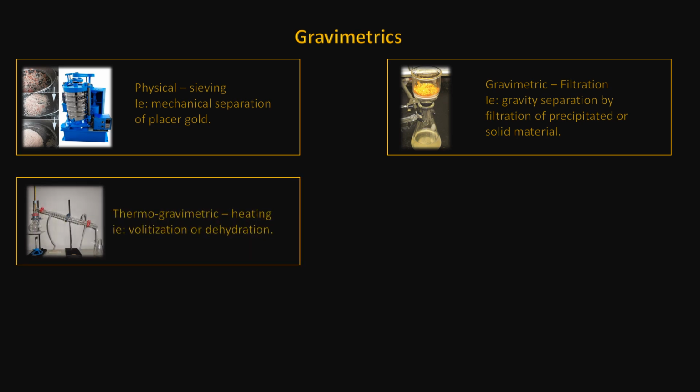Thermogravimetry is simply a method of separating moisture from a sample by placing it into a drying oven to dehydrate any moisture content, or by heating a sample to vaporize any organic material. In other words, burn the unwanted material off, similar to roasting sulfides from ore material.